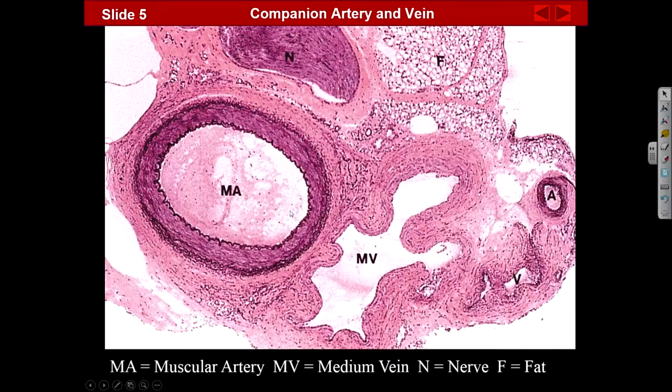Because of the blood pressure, this is a relatively large artery, so it would be under higher blood pressure and it would keep the vessel open, right? Plus it's also got the tunica media here, which will act as structural support. Whereas the vein is under low blood pressure and it doesn't have that tunica media, so the lumen's just going to collapse. Is it always what? Whenever we see it like this is the vein, is the vein always collapsed? Usually, yeah. I'm not going to say always because you never know what you might see, but under most circumstances, yes.